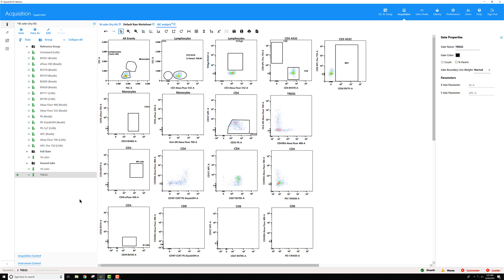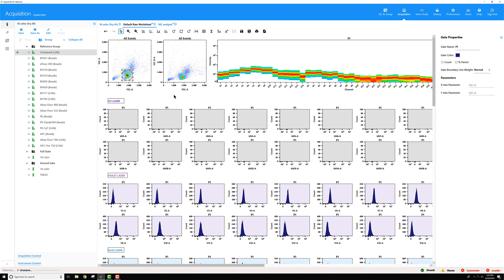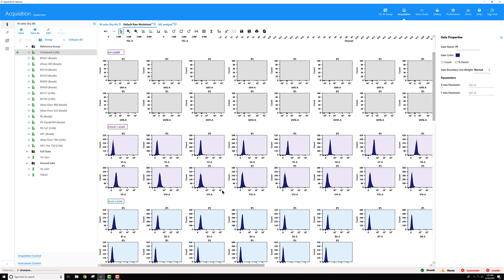If I'm interested in exporting the raw data, I need to be pointed to a raw data worksheet. So let me choose one of my controls, for example, this unstained tube, and then I will go to the default raw worksheet, have this P1 gate on my lymphocytes.